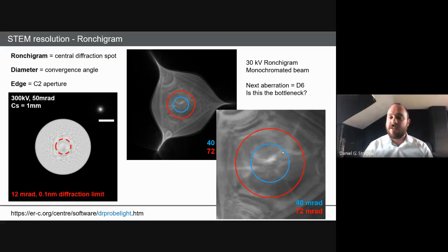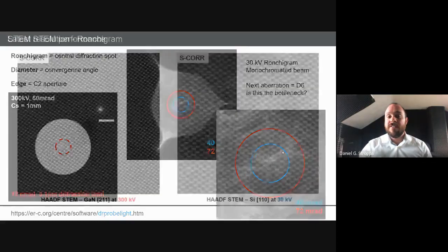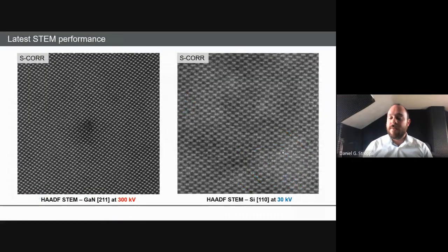and it is much safer. You're probing point by point, and you get signal point by point. So when you see an atom, you see an atom. There's no way to get it wrong in terms of high angle scattering. Here's one example showing what we can get today when you're looking at a gallium nitride sample, for instance, and when you do the Fourier transform and see the frequencies we're transferring, we're below the 50 picometer level.